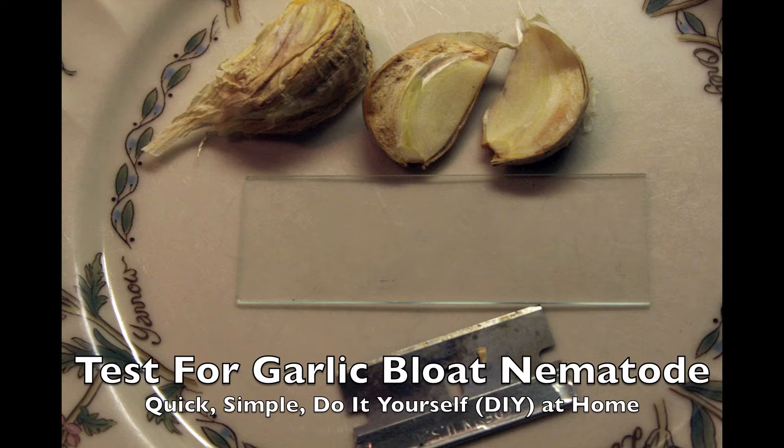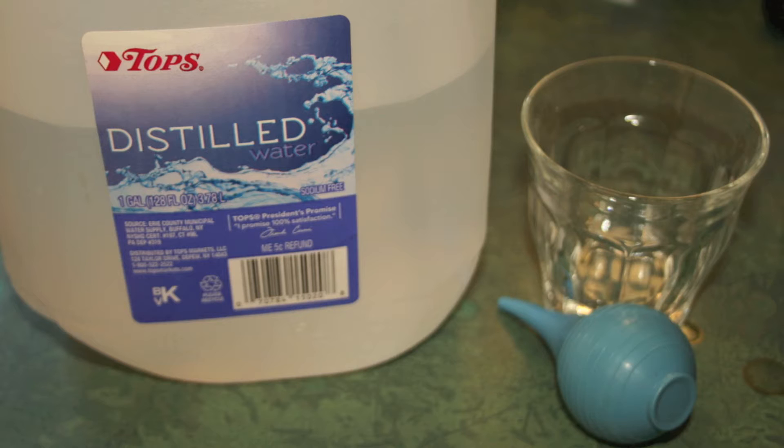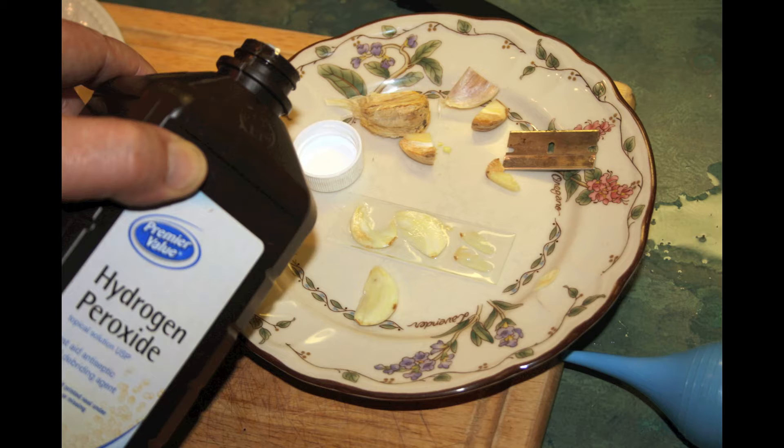You want to get the slices pretty thin — I use a razor blade. Put them on a glass slide, a piece of glass, and you need some chlorine-free water. I'm assuming tap water might kill them, though I'm not sure about that. Just put a couple drops right on them and soak them good with the water. I've also had pretty good luck adding a bit of hydrogen peroxide — I don't know whether that oxygenates the water or helps break up the cells. Add a couple drops.